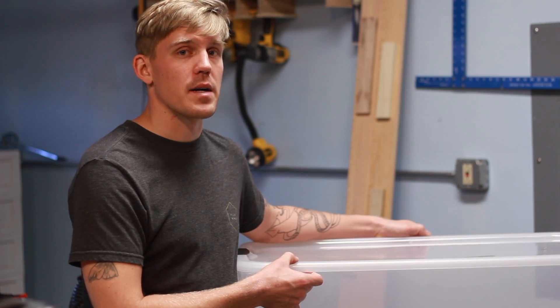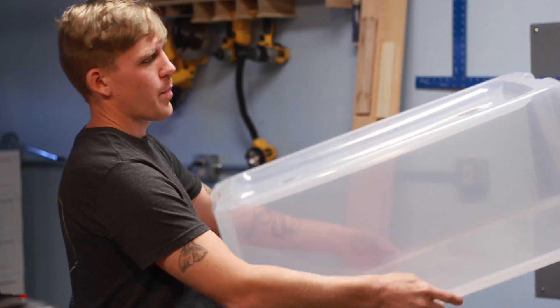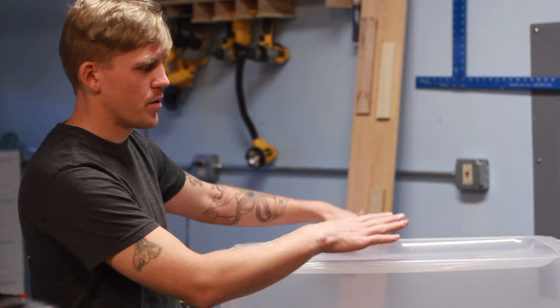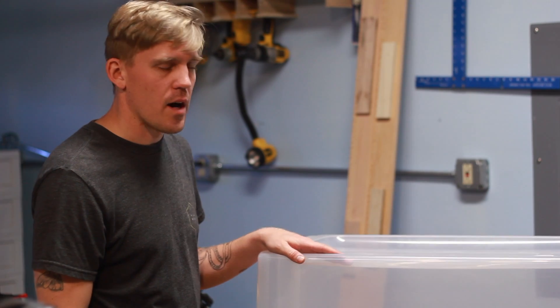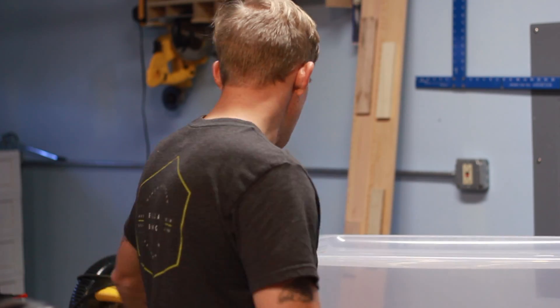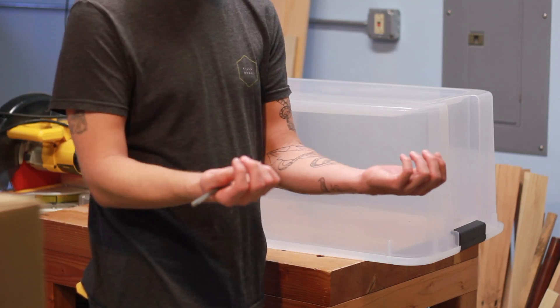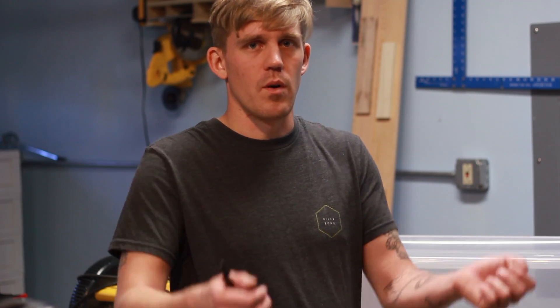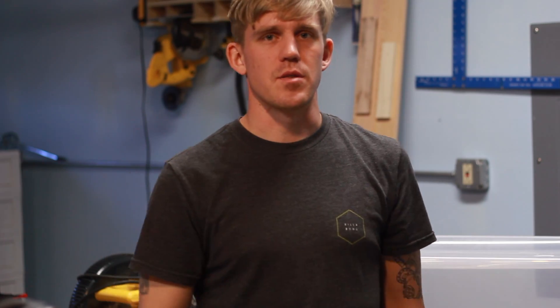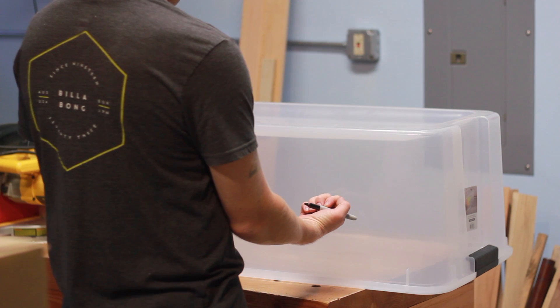I'm going to build this box upside down because I want the lid to be on the bottom. I want the weight of the container to hold the lid down. The next thing to figure out is where to put the holes. You want it set up so that your hands are at a comfortable level — you don't want to be bending over. So we're going to draw two little dots right where we want our hands to be.